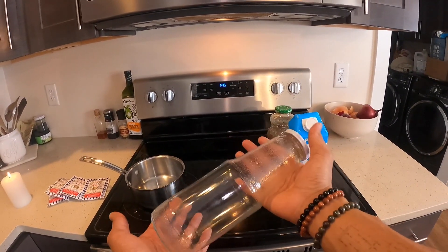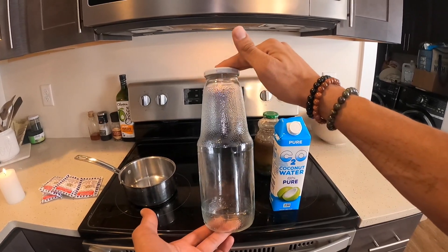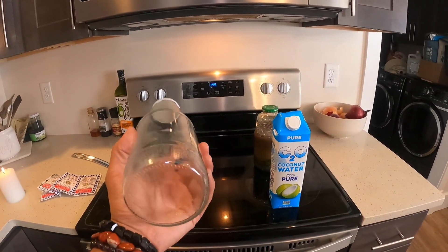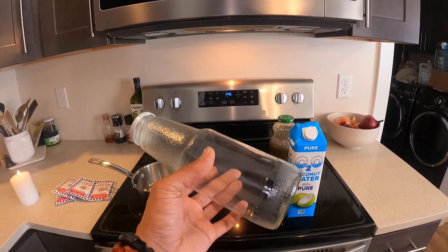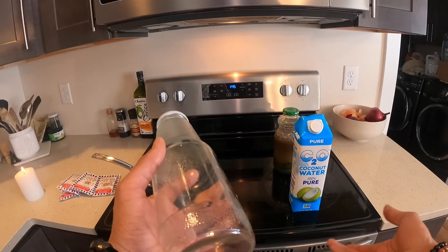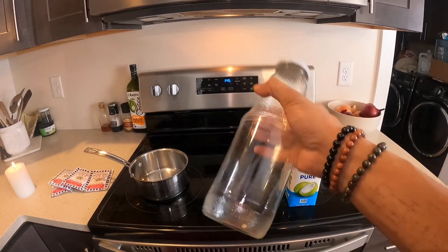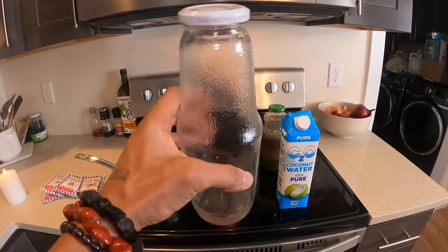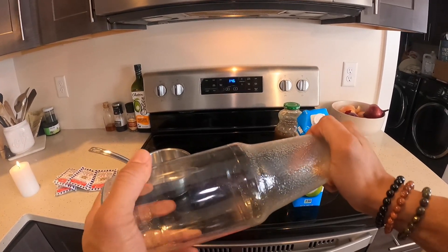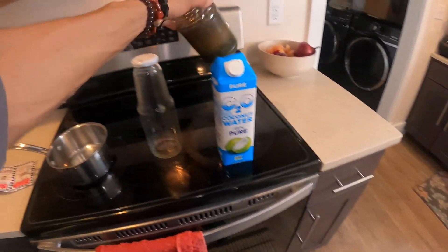We're going to be utilizing this recycled glass bottle as our vessel for the agar going into the pressure sterilizer. This was a juice bottle — it had some strawberry beet juice in it. If you have any health food stores or an organic aisle at your local grocery store, find a glass bottle of juice, enjoy the juice, and save the bottle. These bottles are super good for agar and you can keep reusing the lids until they rust.